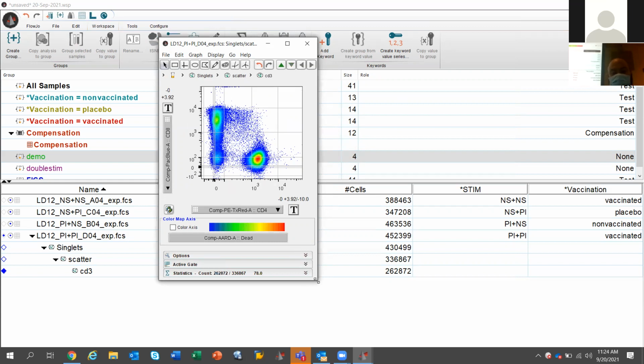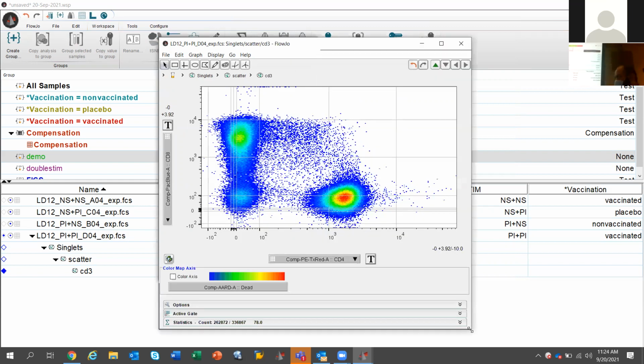Okay, so now that we're here, what are we going to do? I'm going to go over the quadrant question that I was also asked earlier. And then after that, I'm going to go over scaling. After scaling, I'm going to go over the different visualizations we have. After that, I'm going to go over how to generate a gate that automatically locates your cells. So a little bit of auto gating. Okay, now I mentioned the quad gate.